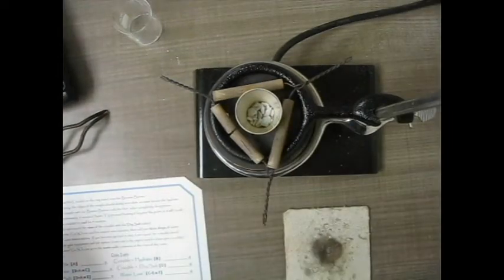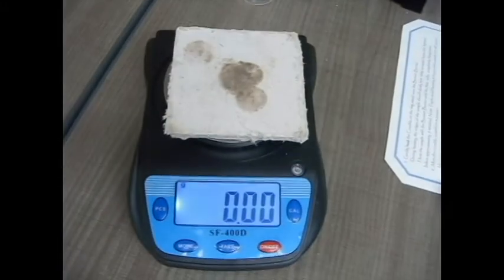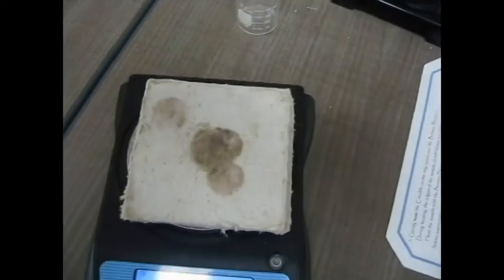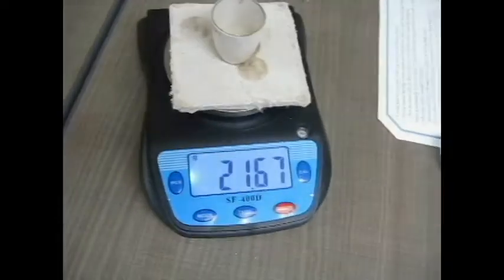Now it looks like the color is gone. So I am done with my experiment. What I'm going to do is, first of all, unplug my hot plate. Unplug that. It'll start to cool off. I'm going to take the crucible off of here, okay? And we're going to tare the balance just to make sure with those two pads on it, insulating it. And I'm going to take the mass again. This should match. This would be our double check.